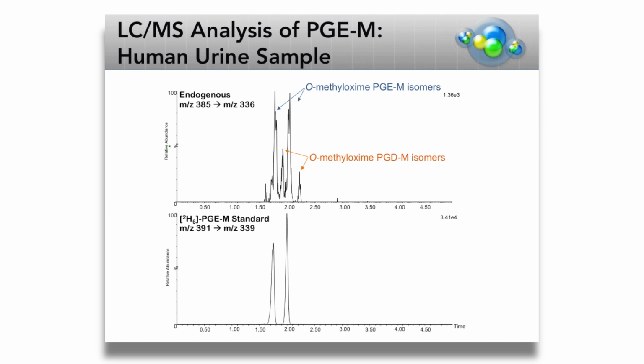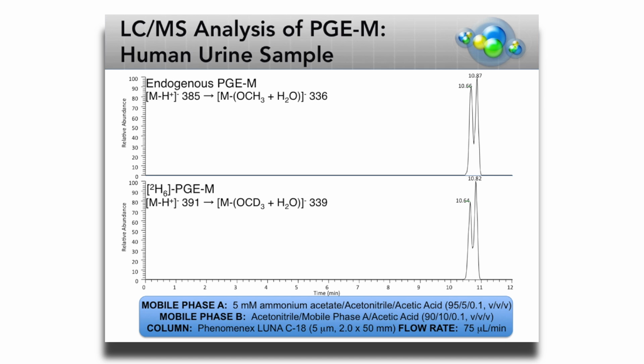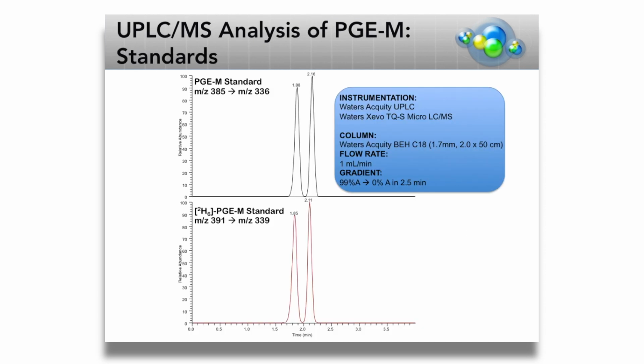So this slide and this chromatogram using UPLC truly highlights the need to use good chromatography when studying compounds that are complicated, such as eicosanoids, when many different isobaric species might exist. In the early days, the PGD metabolites were being buried in this LCMS analysis, but can now be separated and quantified alongside the PGE2 metabolite.